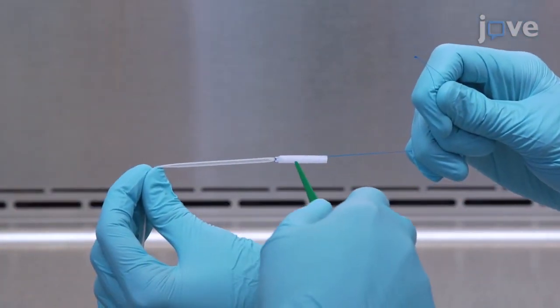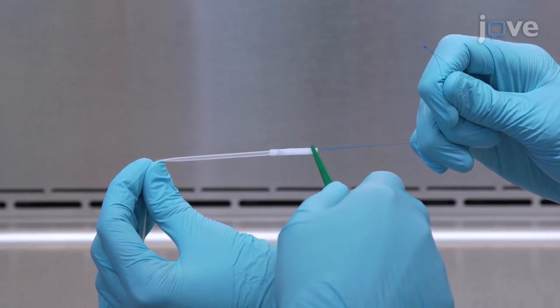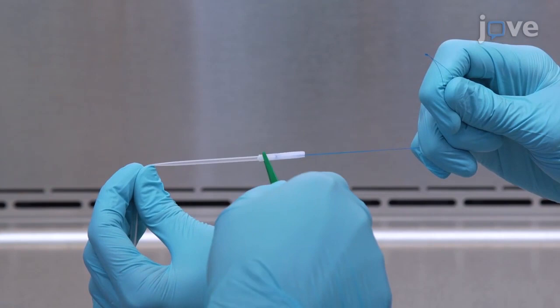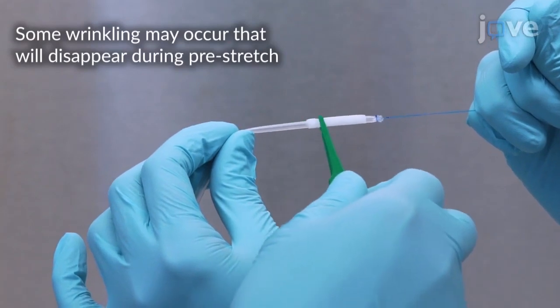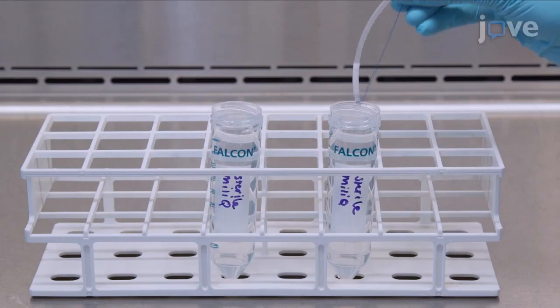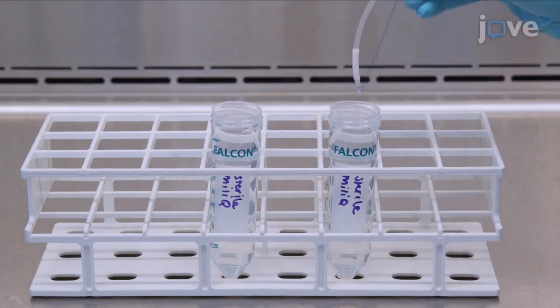Next, gently stretch both sides of the silicone tubing and the 10-centimeter suture knot, while a second researcher uses tweezers with a smooth inner tip to gently slide the electrospun scaffold over the tubing. Slowly release the stretch on the silicone tubing while simultaneously smoothing the electrospun scaffold with the tweezers, and dip the scaffold and silicone tubing in ultra-pure water 2 times.